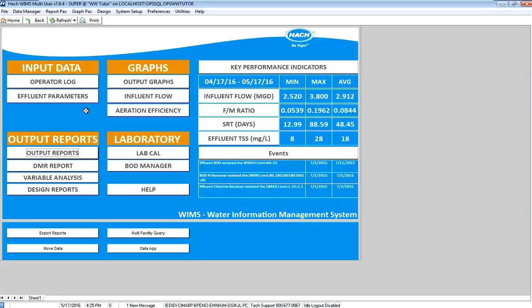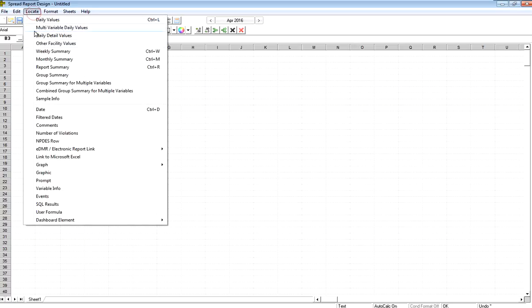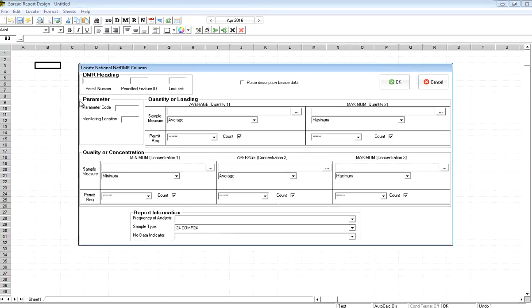In this video, I'll be covering how to design and output your NetDMR report for wastewater regulatory reporting. In order to design that report, I'm going to use my shortcut button for Design Reports. It doesn't really matter where I start, but I'm going to click on B3, go to Locate, EDMR, National NetDMR.